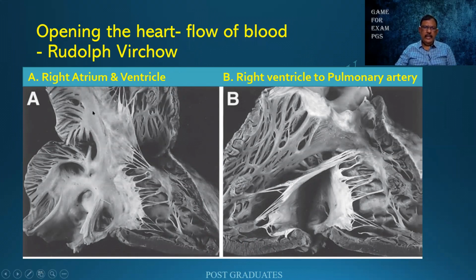Initially, as I mentioned earlier, the right atrium and the right ventricle. The right atrium is opened up and then the right ventricle is also seen below. One thing I would like you people to appreciate is that there are a lot of foldings and ridges, which makes this different from the left side. The left side, you find, is a little more bland. I have to look into the pulmonary artery and the tricuspid valve, and finally I will have to open it up. And when I do, I'll be finding the pulmonary artery over here. So I look for any abnormalities. They can be acquired, they can be congenital.